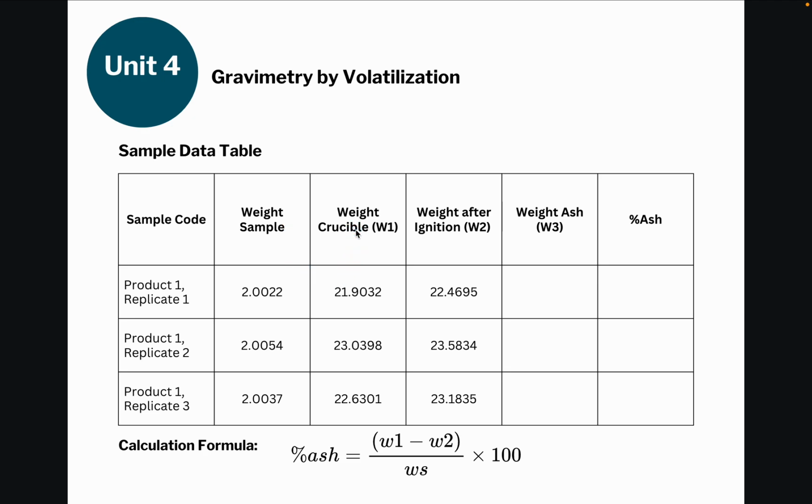So what do we mean by constant weighing? This means that you have minimized the moisture present on your crucible by subjecting it to oven drying and then cooling it and weighing it. Of course, we also need the weight after ignition. To get the weight of the wet sample per crucible, you just need to add these two. But after ignition, this is our measurement.